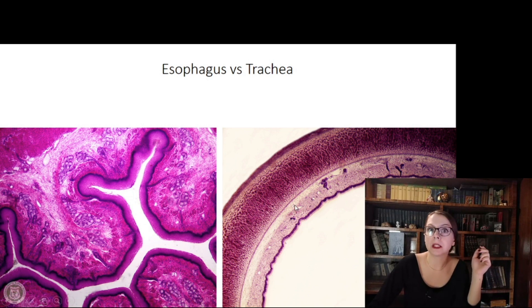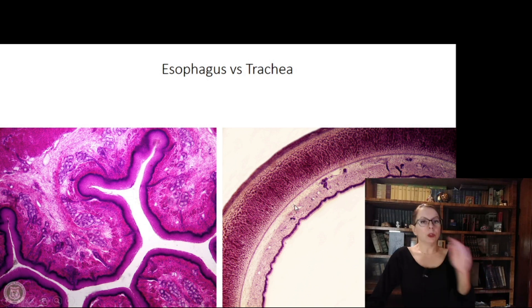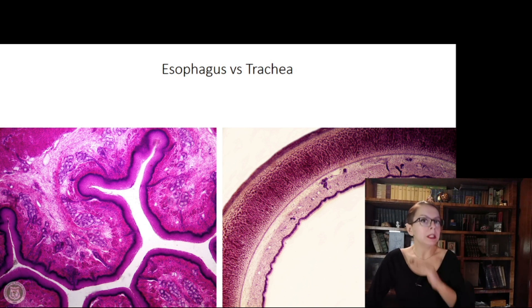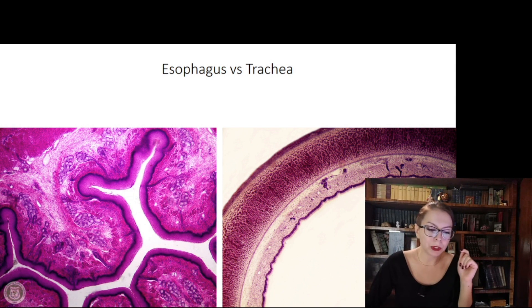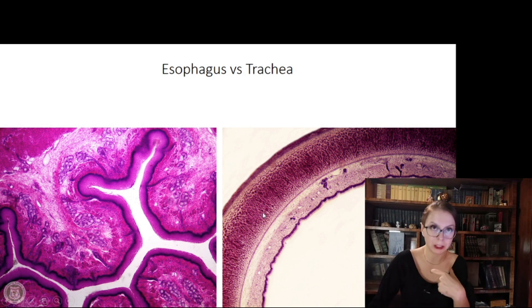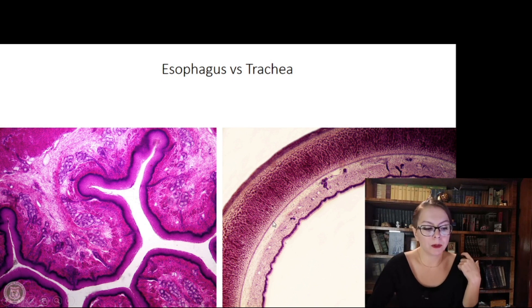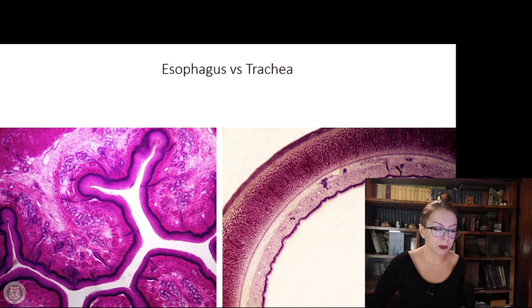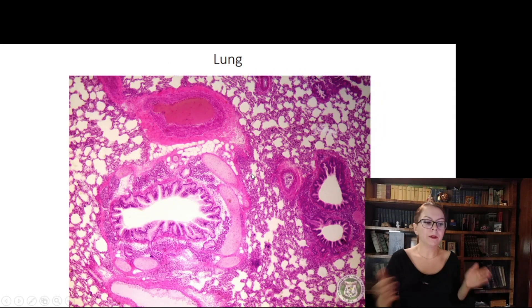In the trachea, the epithelium is pseudostratified ciliated. After that we have the lamina propria and submucosa — they are not separated by a muscularis mucosae, which is absent. Then cartilage is present, which is C-shaped because the esophagus is located behind the trachea, so it should not collapse. This cartilage is surrounded by the perichondrium. All envelopes are very well distinguishable, including the adventitia.